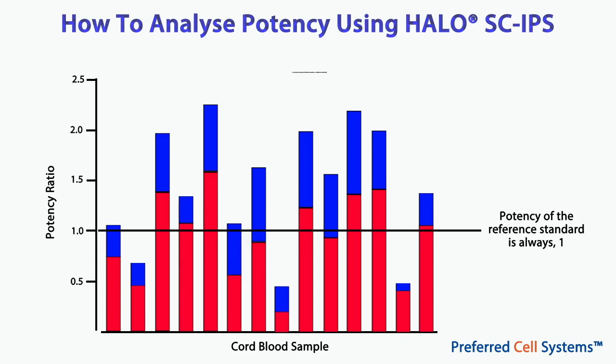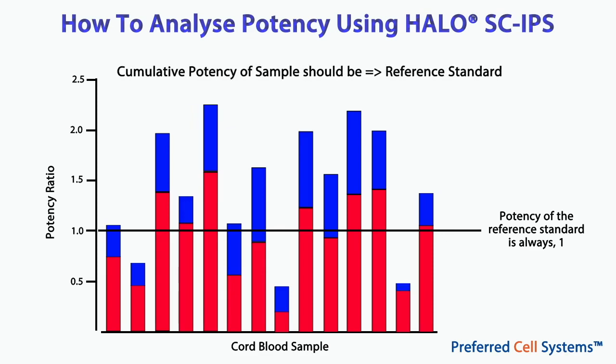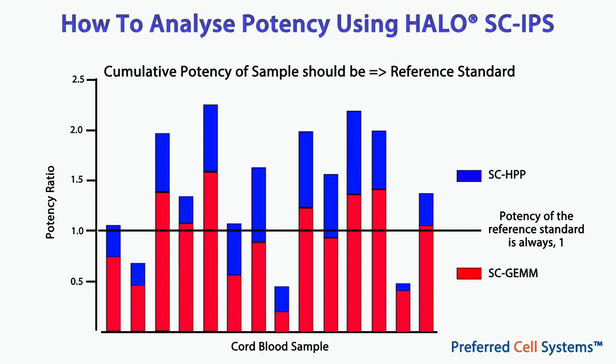It follows that your sample, and therefore your stem cell product, should exhibit a potency ratio similar to that of the reference standard or better than that of the reference standard. The combined potency ratio of both stem cell populations, namely SC-HPP and SC-GEMM, should be equal to or greater than that of the reference standard. There are many in-between values and conclusions that are possible. However, this type of graph tells you instantly whether a product can or should be released for use in a patient. As you can see, the results, interpretation, and conclusions far exceed those using any present tests.